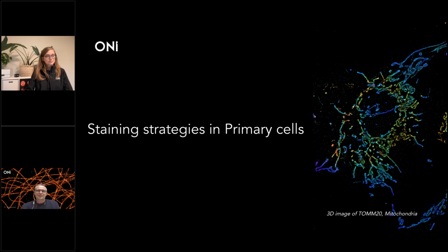But they should not be CD8 positive, so they are not CD8 positive. In this case, they are good because they're immortalized and you can expand them, and they give you a group of cells which should always give you the same type of result. In terms of primary cells, you are getting them from different donors. So each donor is different. They can have different HLAs, they can have a different ethnicity, and so on.